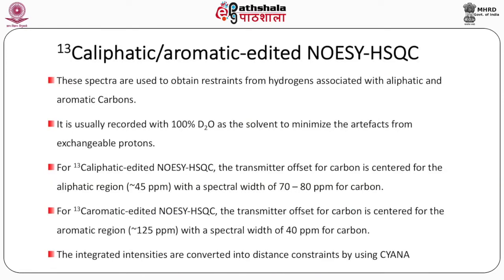C13 aliphatic and C13 aromatic edited NOE-HSQC. These are two different experiments. These spectra are used to obtain restraints from hydrogens associated with aliphatic and aromatic carbons. It is usually recorded with 100% D2O as the solvent to minimize the artifacts from exchangeable protons. Generally, amide protons are exchangeable.